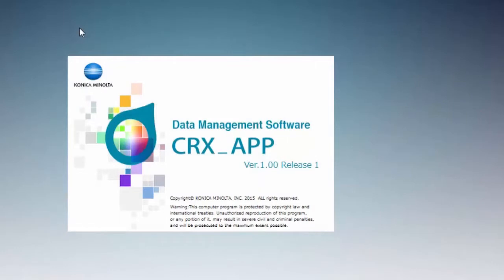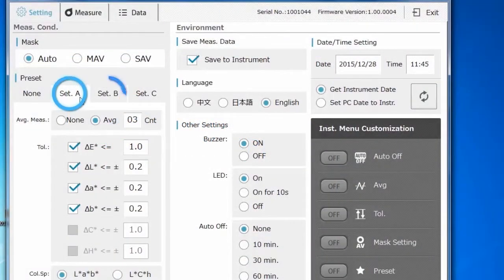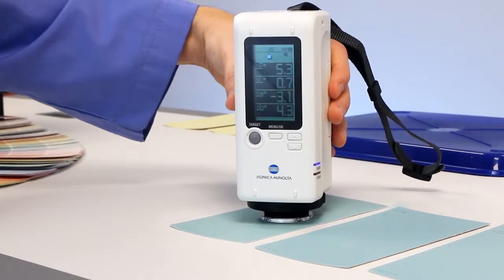These settings will highlight your out-of-tolerance sample readings. Measurements are set in the standard illuminant D65 with a 10-degree observer and specular component included.